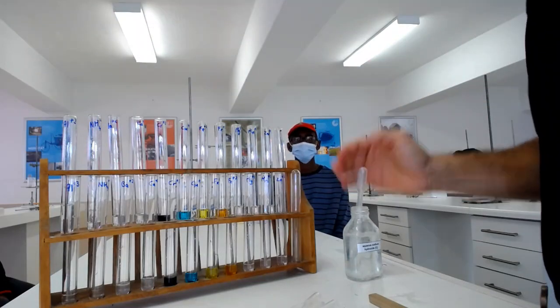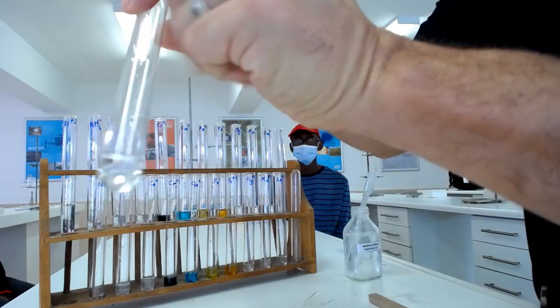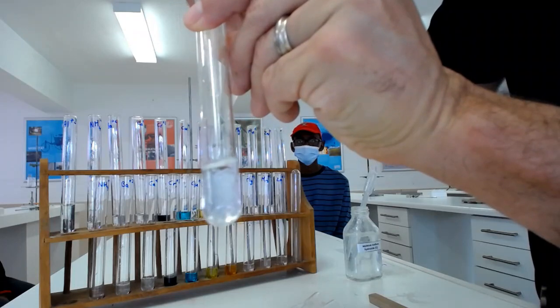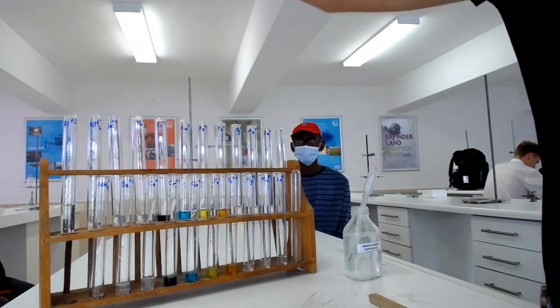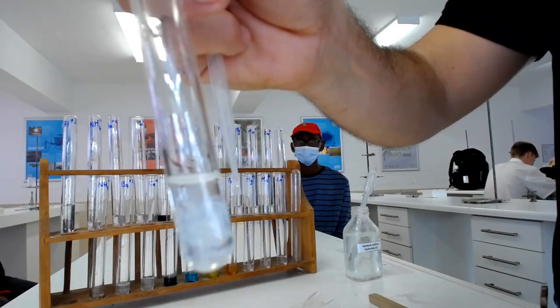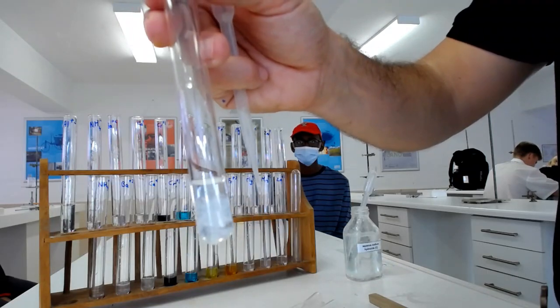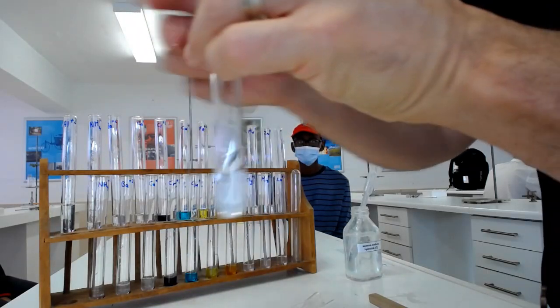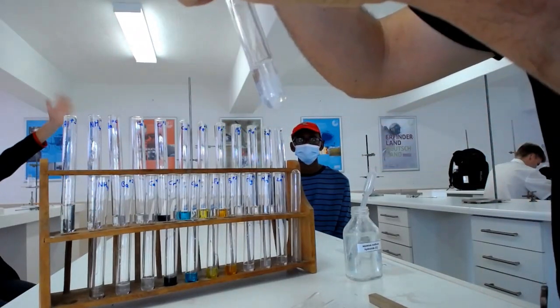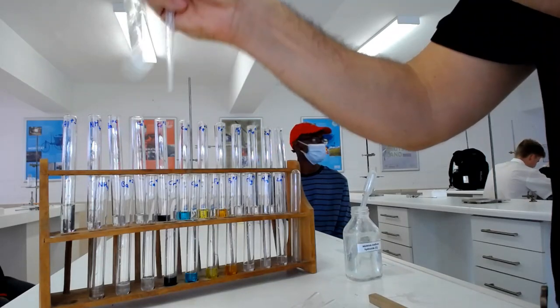So what happens if we add the ammonia to aluminium? Andrea, what happens? White precipitate. Is there a white precipitate? Oh, there's a precipitate in there. You see, sometimes it is really faint. If I add more, what happens? If I added an excess? It's insoluble, so that precipitate stays. It's not going away.